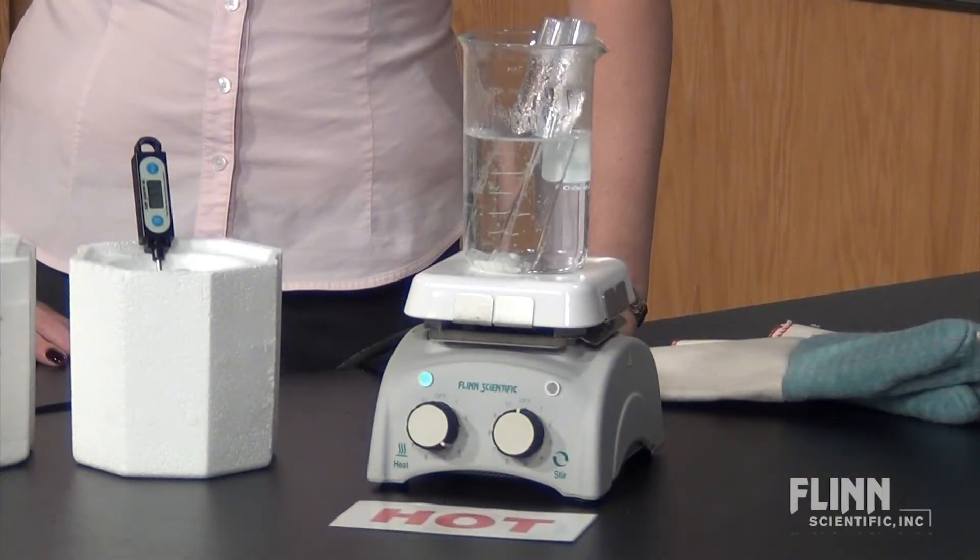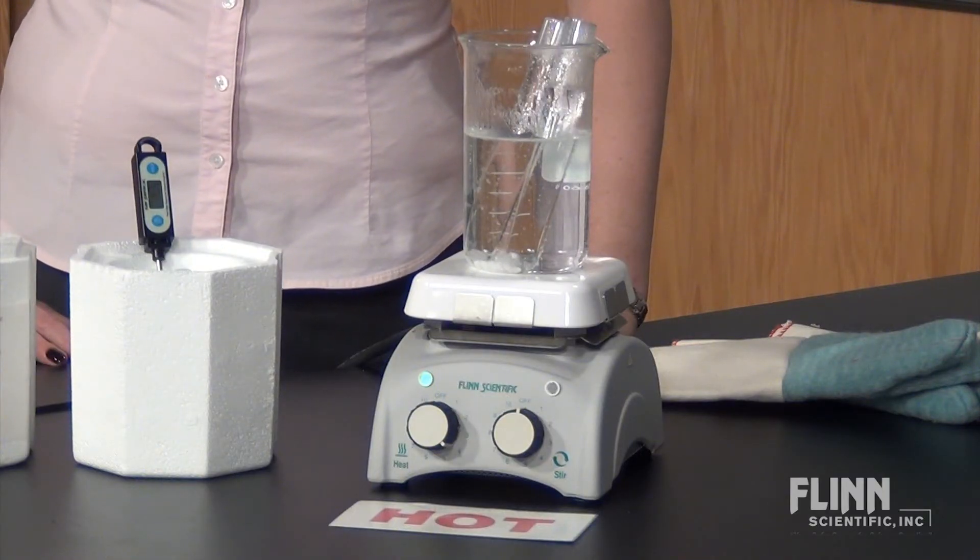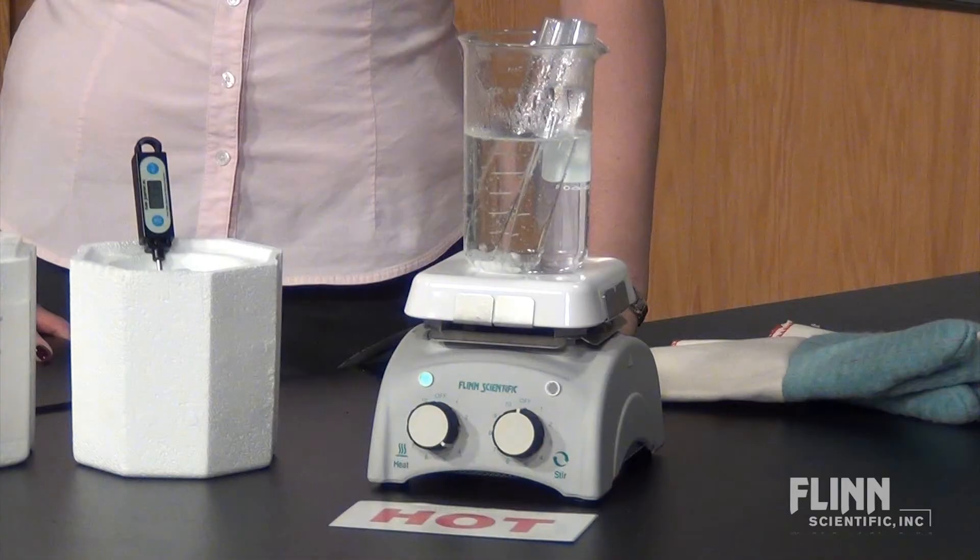The best way to set up a hot water bath is to use a hot plate. The hot plate can maintain the temperature within a couple of degrees for long periods of time.